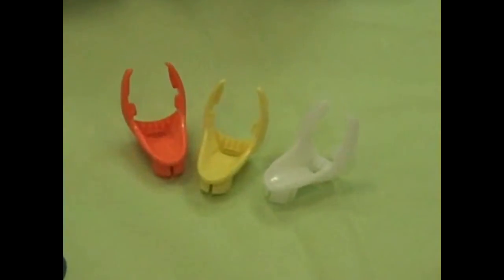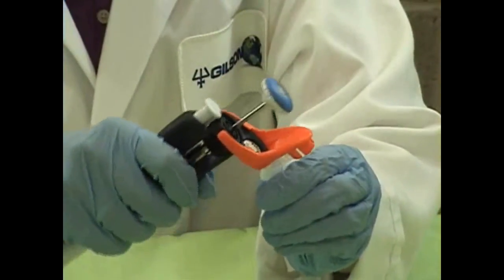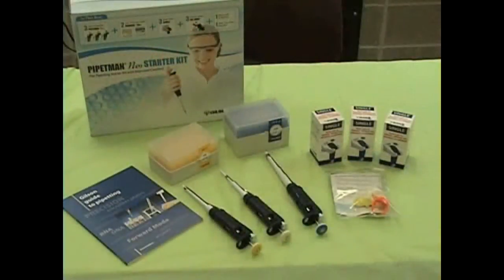The Jemmie Microtube Opener is attached to your Pipetman Neo pipette and helps you open both flip-top and screw-top microcentrifuge tubes with ease, saving your fingers and thumbs from the wear and tear of opening lots of tubes.